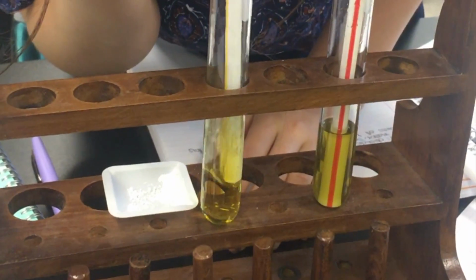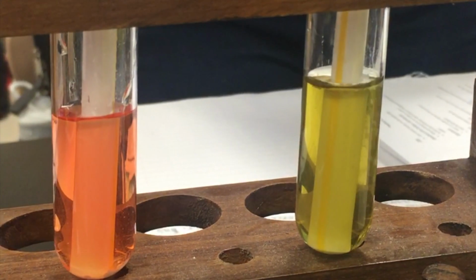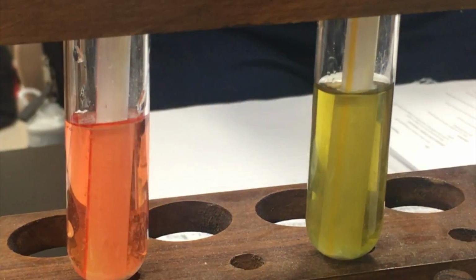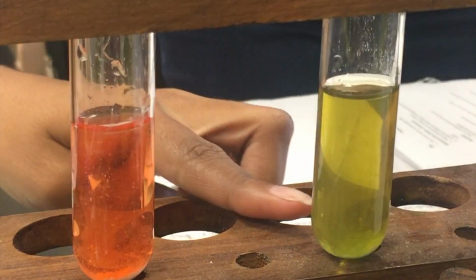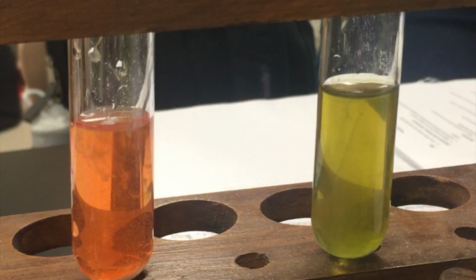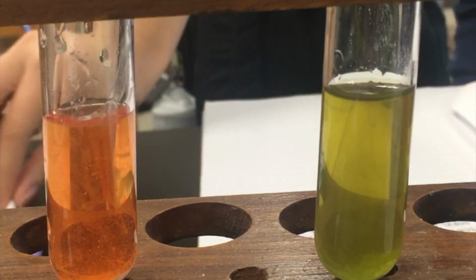The same process is repeated for the distilled water. We then recorded the change in the pH for each type of water. In both of these situations, the change in pH or the change in color depends on the amount of carbon dioxide put into the waters. In this step, we now add calcium carbonate to each of the test tubes. You can see after adding the calcium carbonate, each color or pH of the waters begins to slowly change. In this situation, the change in pH or the change in color depends on how much calcium carbonate is put into the water.